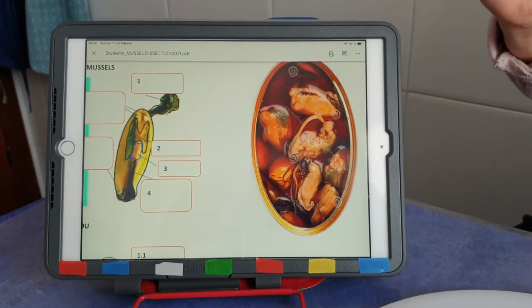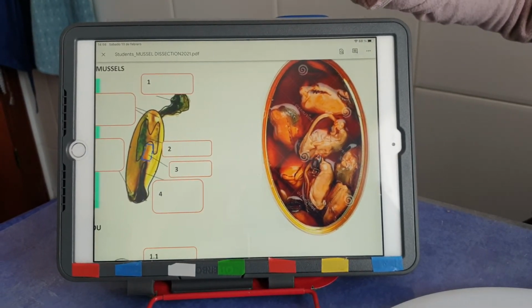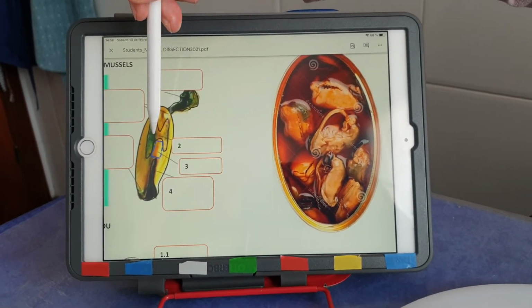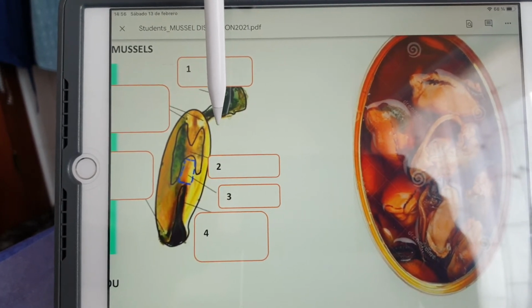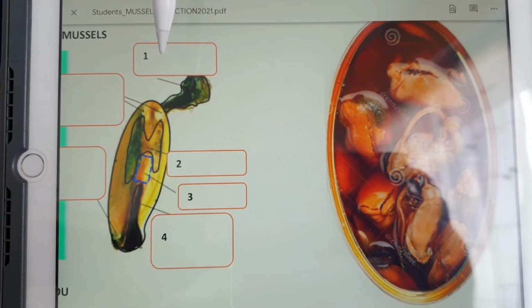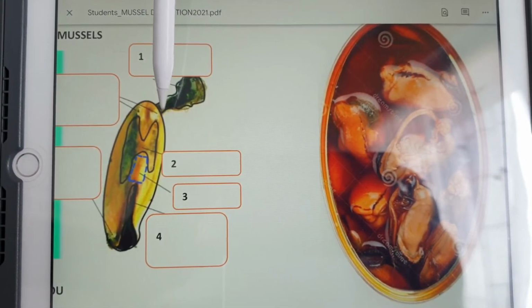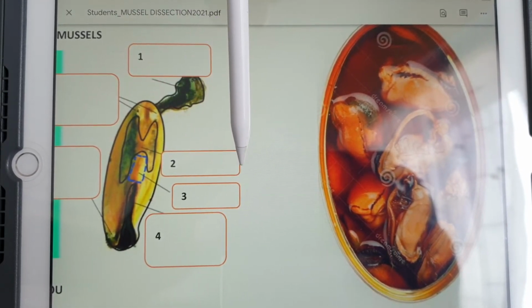We are going to learn how we can determine where the heart is. First, can you see the green area? Can you see the H? If you can see the H, you can see an organ that is two organs in our body, in human's body. This organ is at the same time the liver and the pancreas. So the name is a combination of liver and pancreas. The name is hepatopancreas. So the number 2 is hepatopancreas.